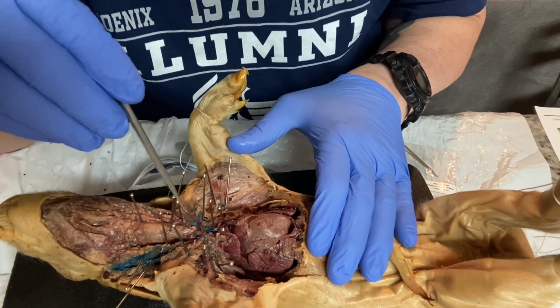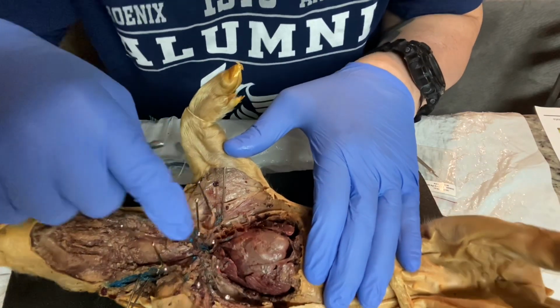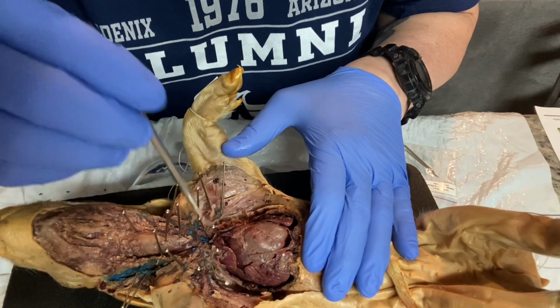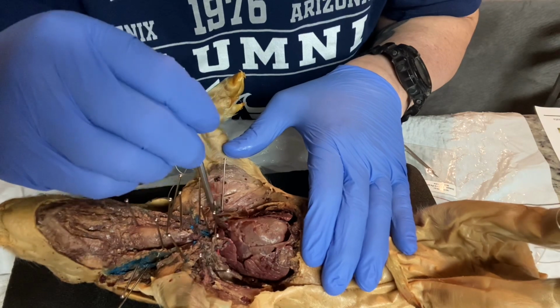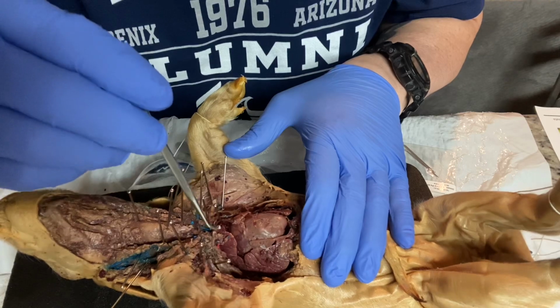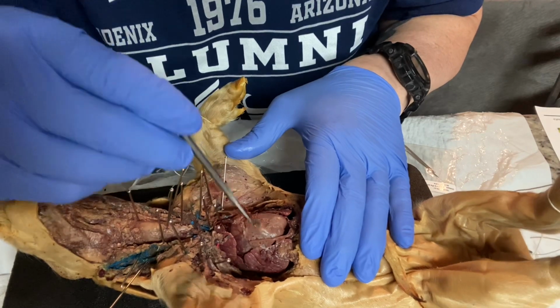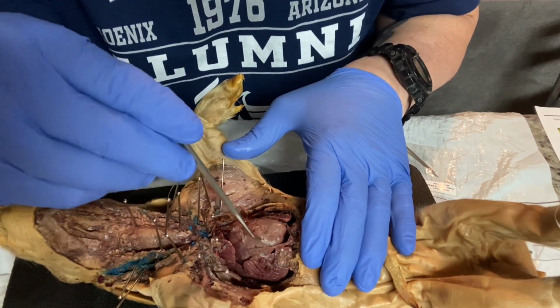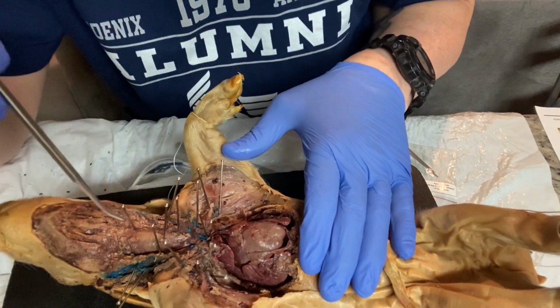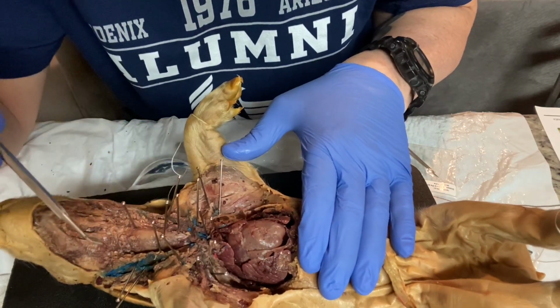brachiocephalic trunk. And you got your aorta here where this pin is, right here. It's kind of hard to see, but I marked it with a pin. And then kind of over the lungs here, in the heart, here is your superior vena cava. Here's your aorta, and this is the heart here, where my probe is. You got your left ventricle, right atrium, left atrium. And that's kind of the cardiovascular system here.